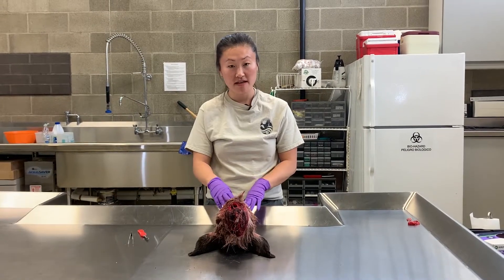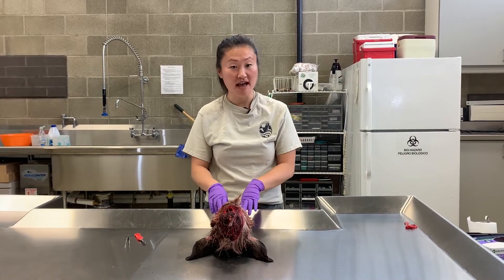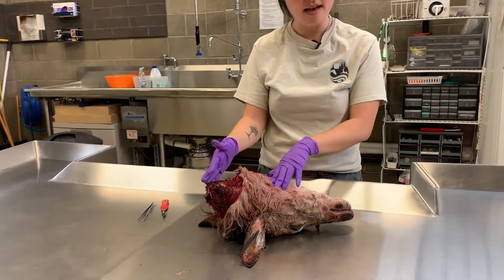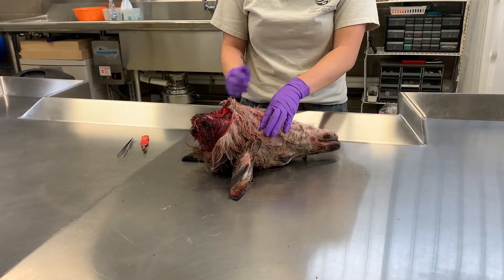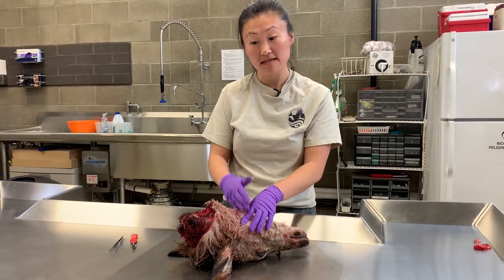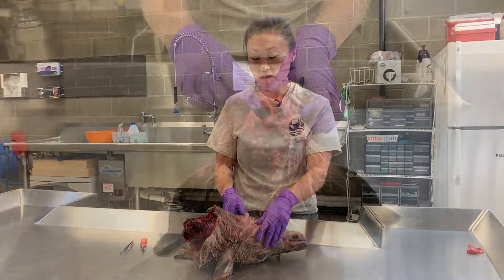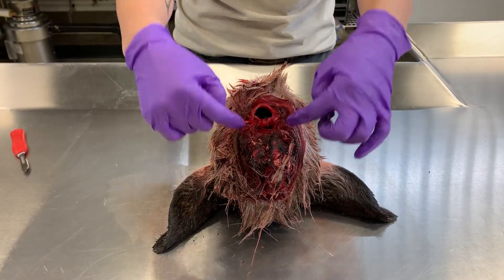I'm going to demonstrate a slightly different way to collect the lymph nodes from the neck, just based on preference and how you'll be able to better visualize them. If you're bringing in a head to have it sampled, we recommend cutting it and leaving two to three inches of neck still attached so that we can make sure those lymph nodes are still in the head. You want to find that windpipe and remember that those lymph nodes are going to be located at 10 and 2 o'clock.